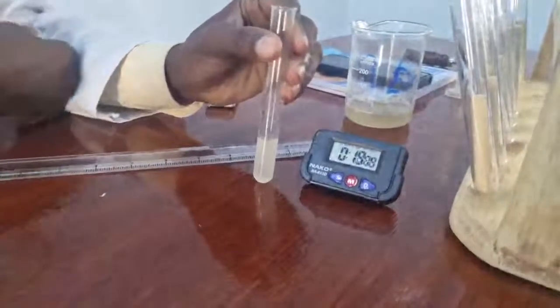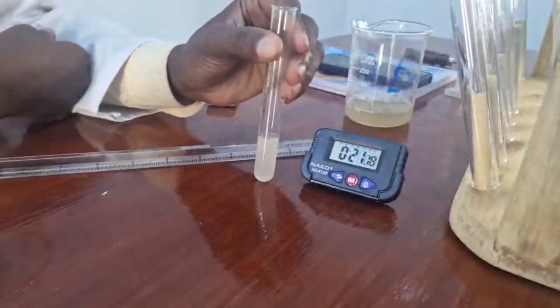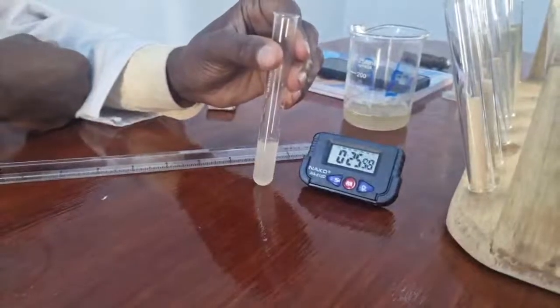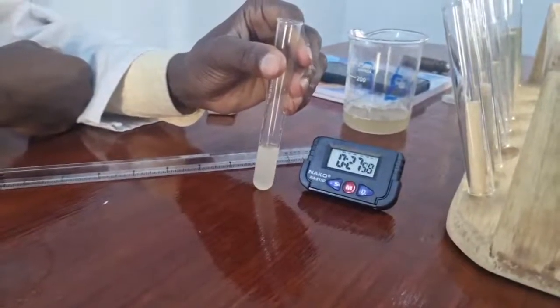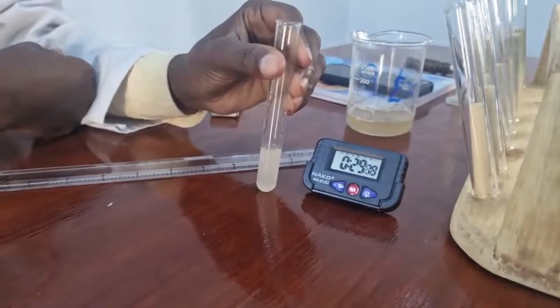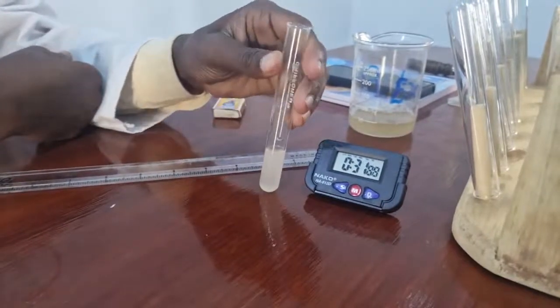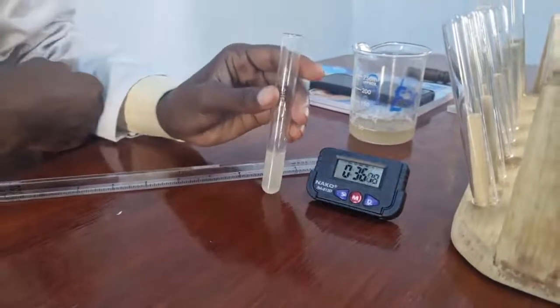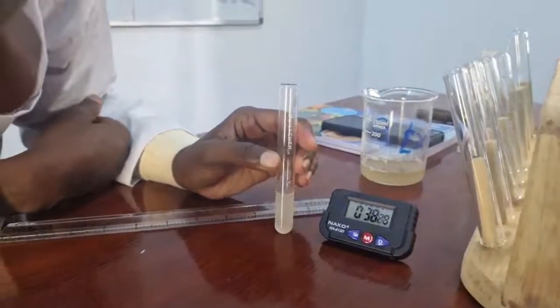I think we are seeing the factors we are investigating. We are about to measure the froth length. I'm so far seeing none of the bubbles coming out. Do we see any bubble there?